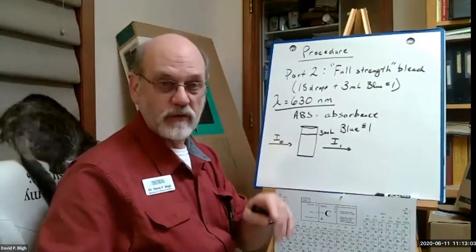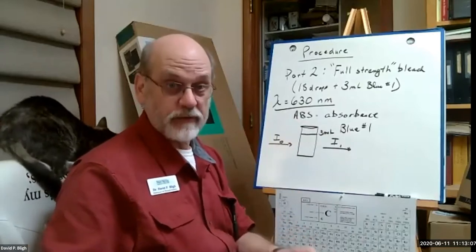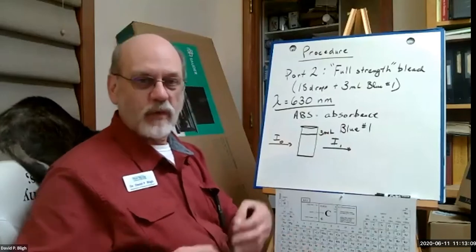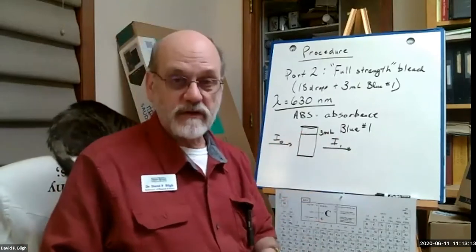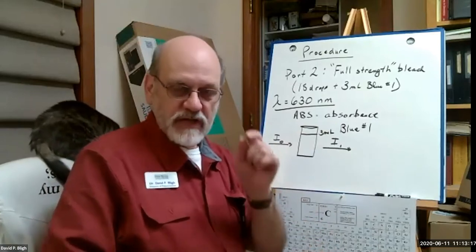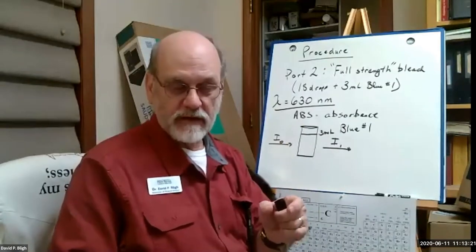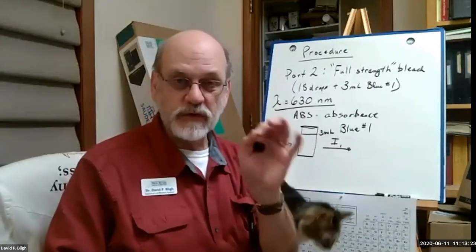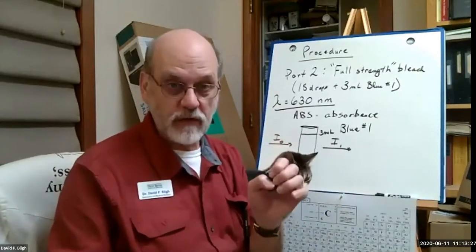So be careful and don't spill any bleach in the spectrophotometer. Why are we doing it that way? Because this reaction is fast. The minute that bleach hits the blue dye, it's going to start reacting. So you're going to miss the first few seconds of the reaction as you add the 18 drops.